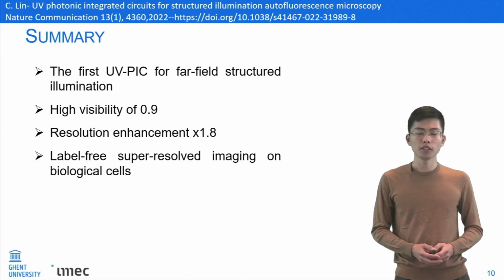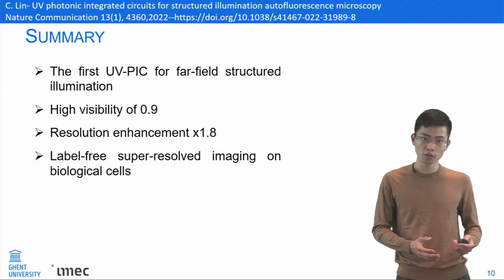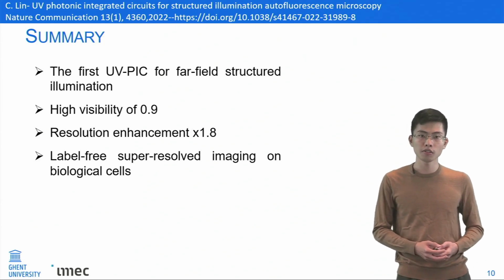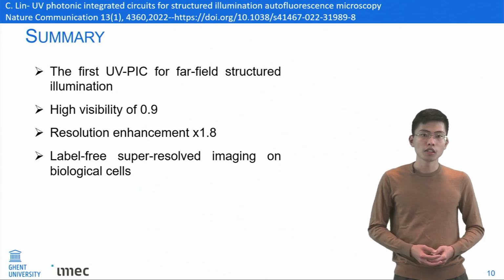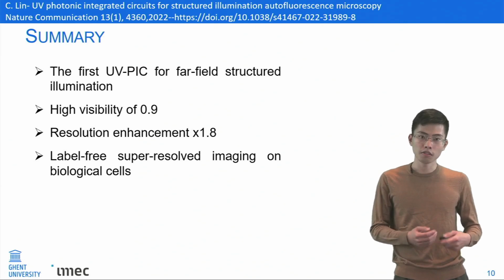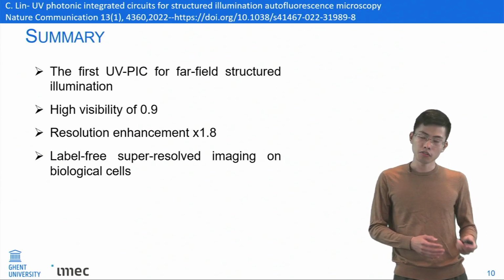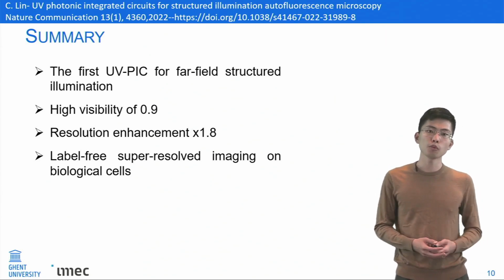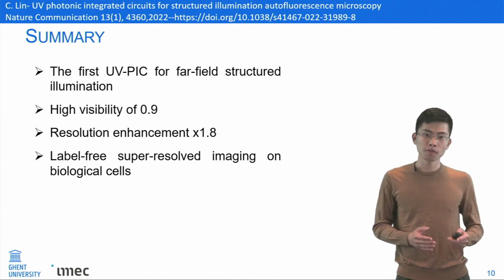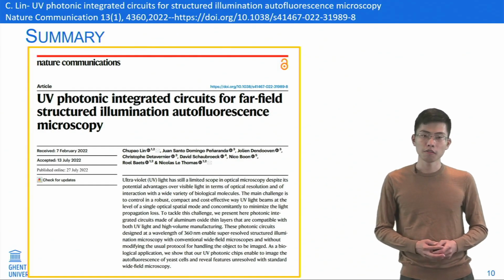To conclude, we have proposed and fabricated the first UV photonic integrated circuits for the generation of structured illumination with a high visibility of 0.9. We have also demonstrated UV photonic integrated circuit-based structured illumination microscopy and achieved resolution enhancement by a factor of 1.8. And more importantly, we have validated the concept of label-free super-resolved imaging on biological cells. If you want to know more details, you can find our paper here.